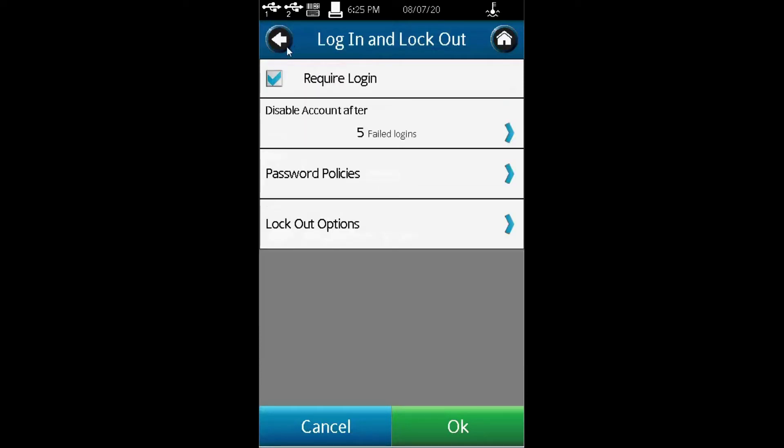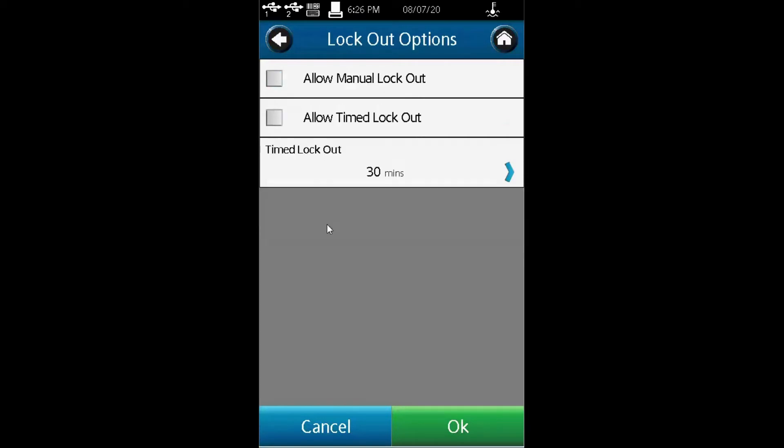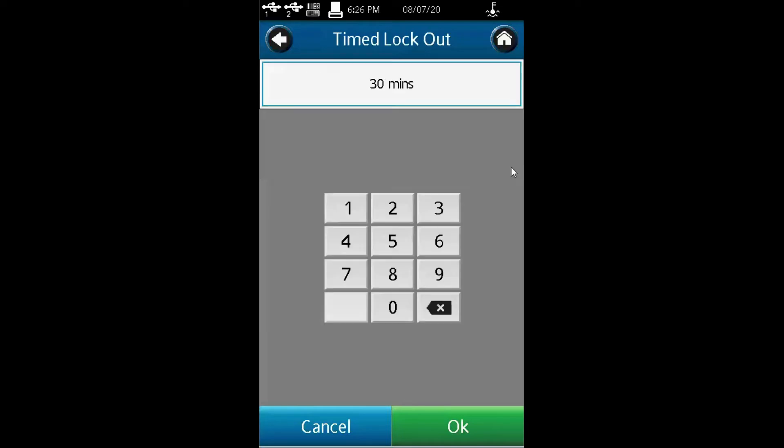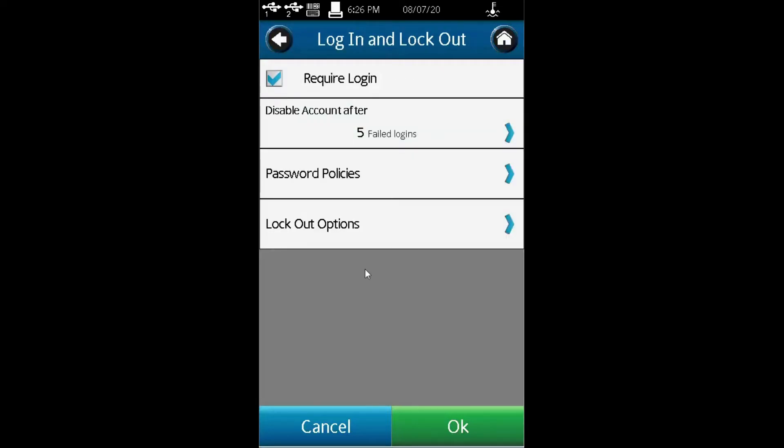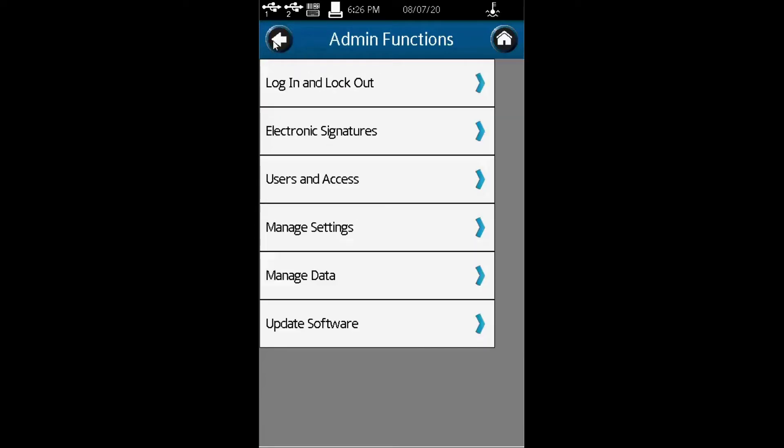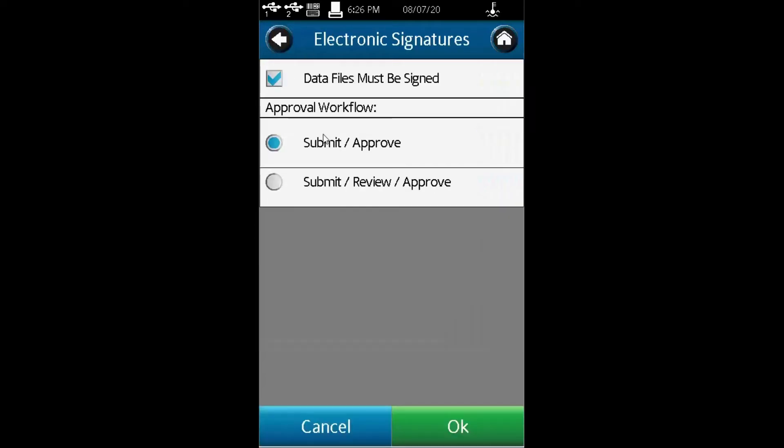It also allows you to set logout options, which means after a certain number of minutes it can time out and go into sleep mode. Under electronic signature, you can set whether the user will submit or approve, submit review and approve, or none at all.